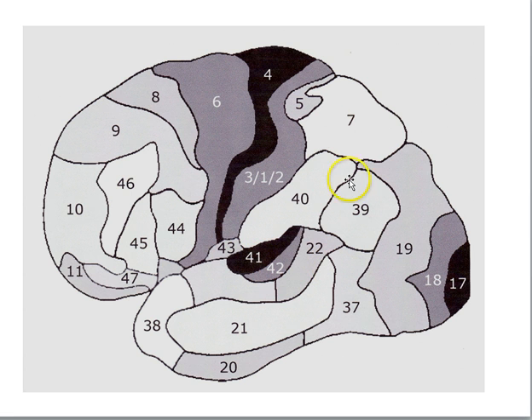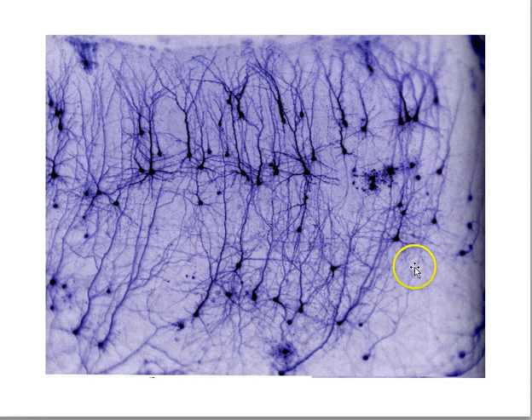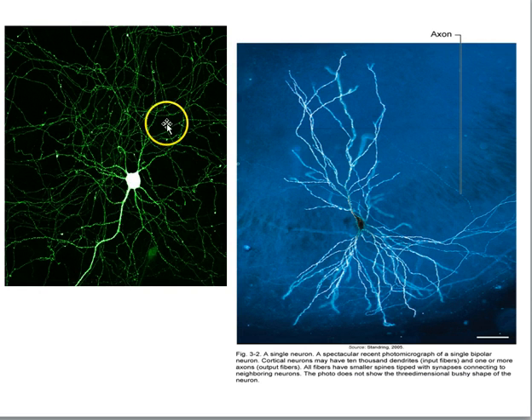If we took a look at what the cells of the cortex look like under the microscope, you'd see something like this, a forest of cells. So the cells have been stained here. The dark blobs here are the cell bodies, and you can see that nerve cells, brain cells, have a lot of extensions, branches off of them. Here we see a single brain cell body in the middle, and this extensive network of branches called dendrites, and those are the receiving areas of the nerve cells.